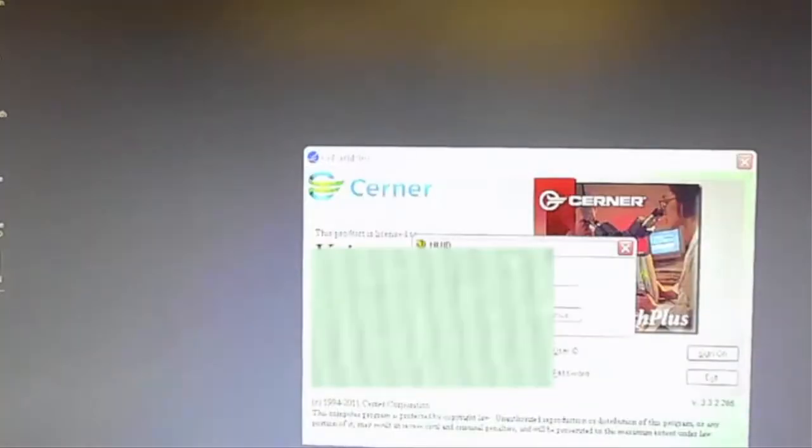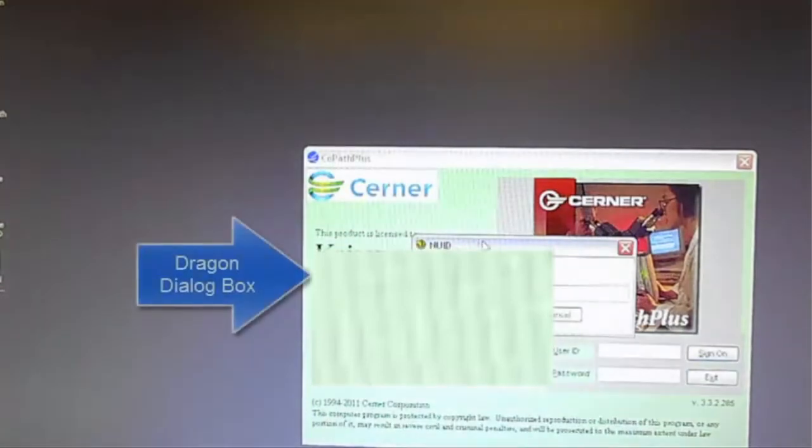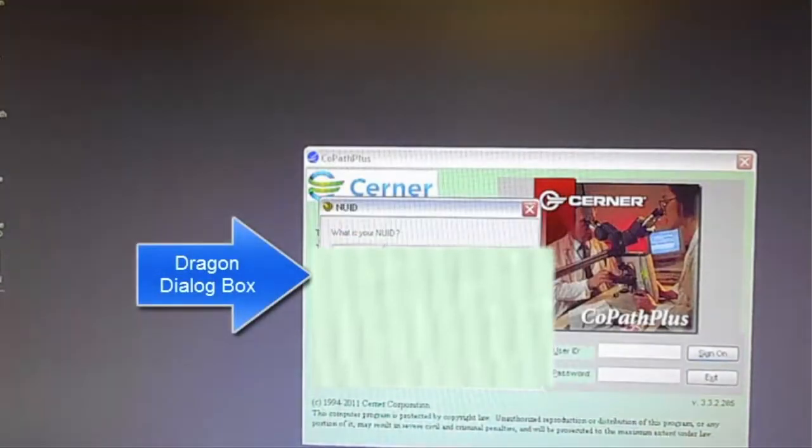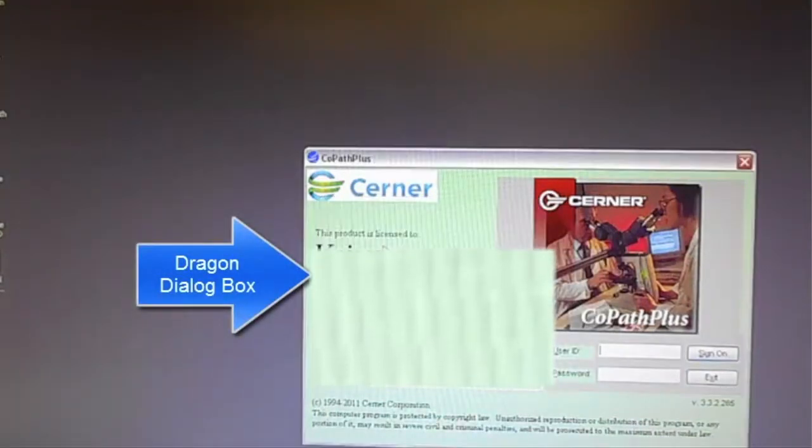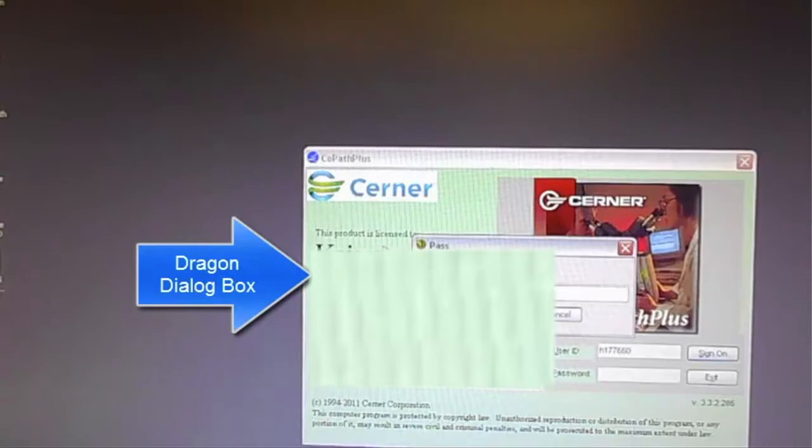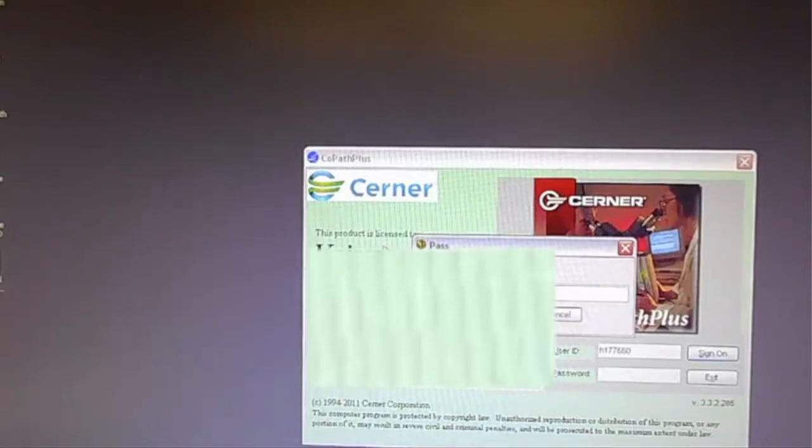So in the first part here, we're going to see me calling a command start dictation. What that's going to do is start up CoPath and ask me for my NUID. This is part of Dragon, this dialog box that's written. That's part of the advanced scripting. That's going to ask me for my password.